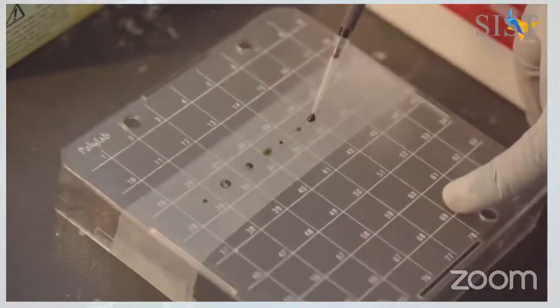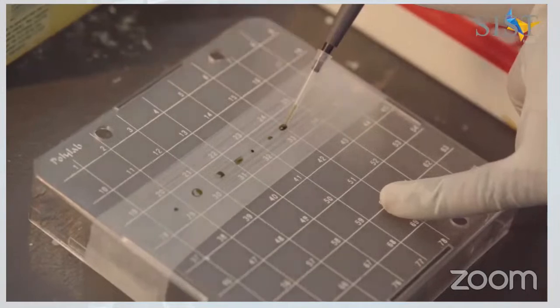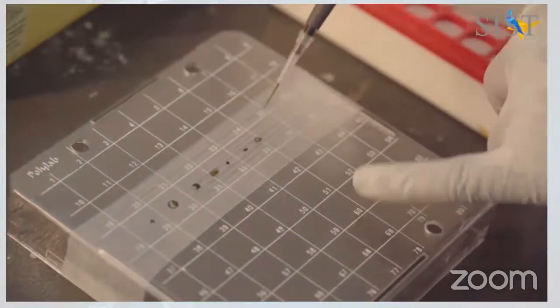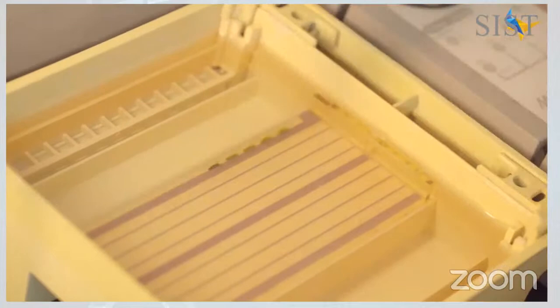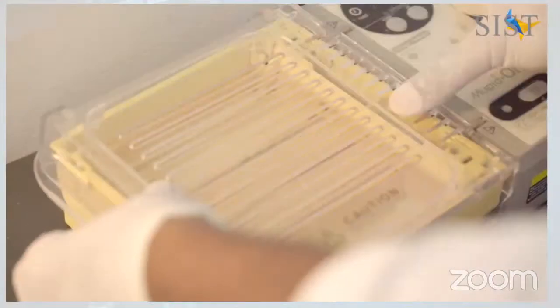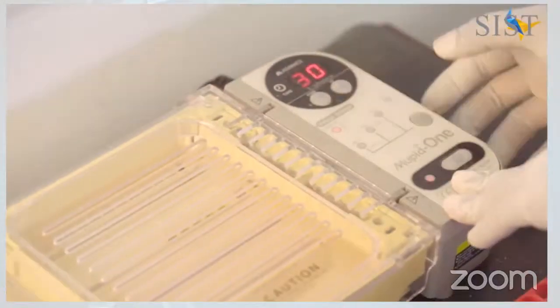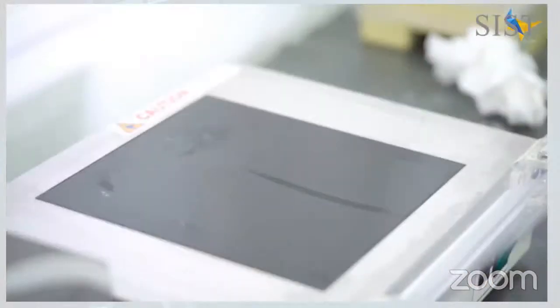When you add your sample onto your loading dye, you mix the contents very well before you load into the gel. This is a very important step as it will allow the mixing of all contents with the loading dye in order to be loaded into the gel. Once all the contents are taken, you carefully load it into the gel. Make sure that you do not damage the wells during your loading step. Once the gel is completely loaded, you will close the gel tank and then set your voltage and your time for your gel run. Once the time is set, you can begin the gel run. And when the gel run begins, you will see the DNA bands separating as per the indication given by the tracking dye.